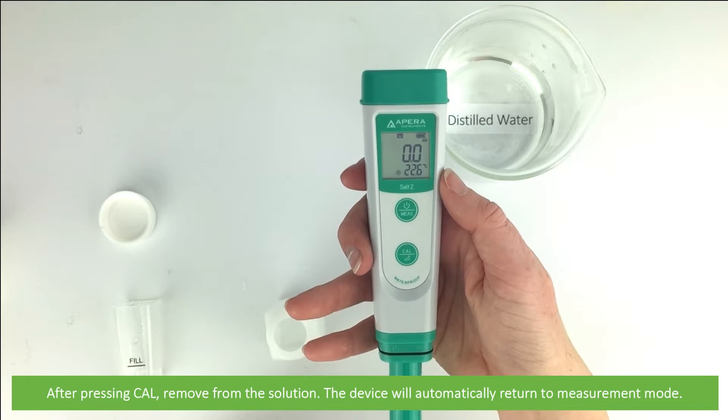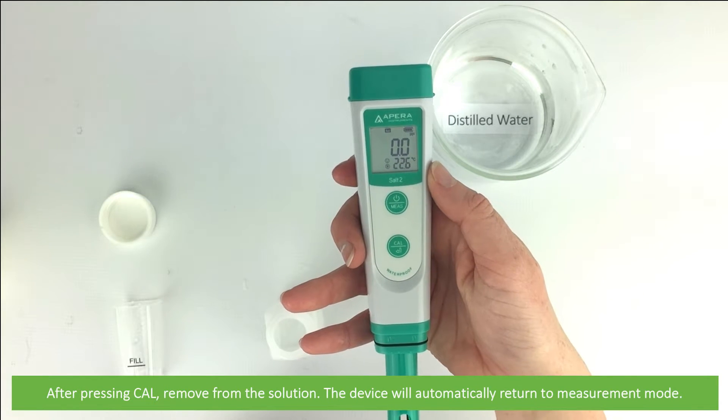Once you've pressed CAL, remove from the solution. The device will automatically return to measurement mode.